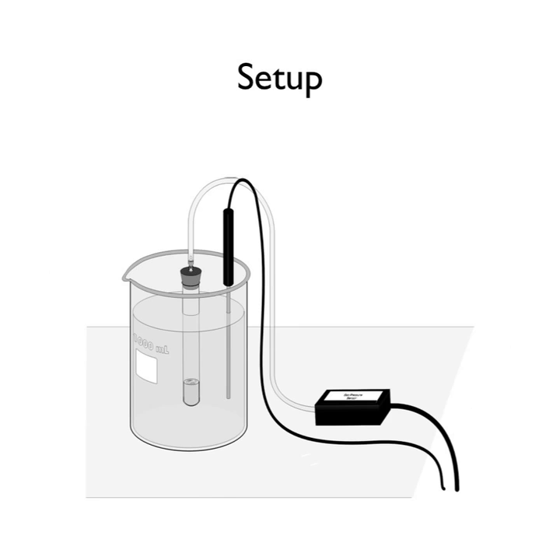And then finally for part 4, we would be decomposing a 3% hydrogen peroxide solution with 0.5 molar potassium iodide solution at around 30 degrees Celsius. Conduct part 4 of this lab as you did in part 1, with the only exception that you'll be using a water bath temperature of about 30 degrees. You can achieve this by heating water or getting some hot water from the tap. Once you've completed part 4 of the lab, you're ready to begin your data analysis.